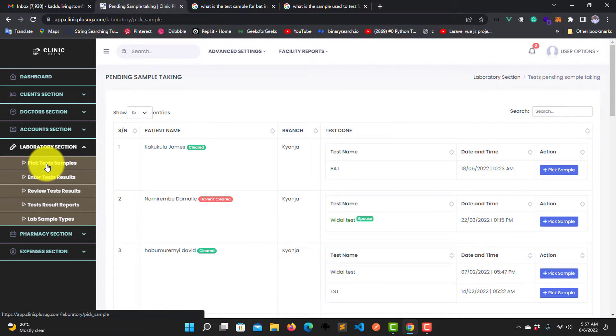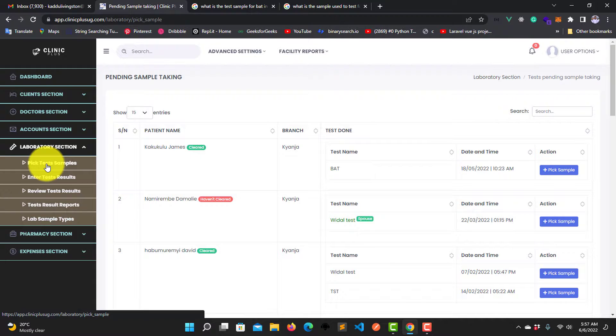After it opens, you are going to get all the patients that have ordered for lab tests.